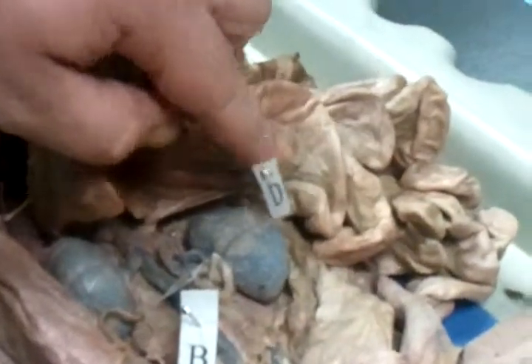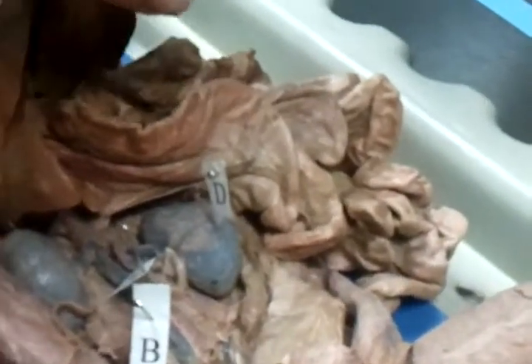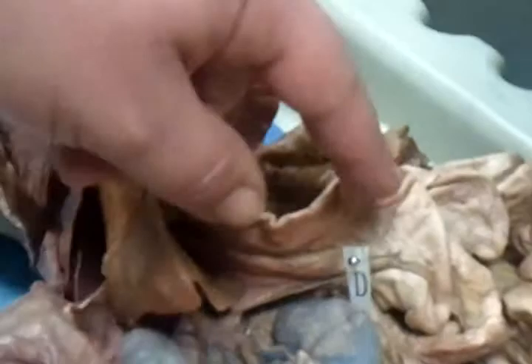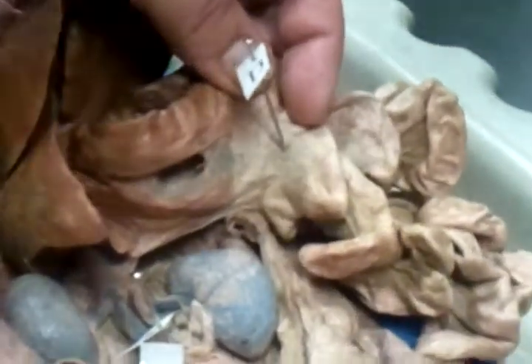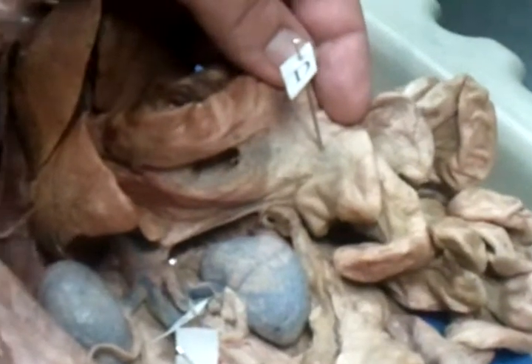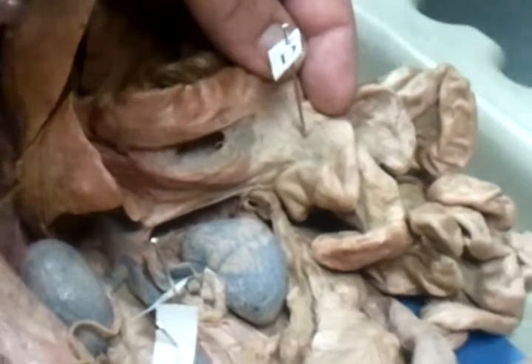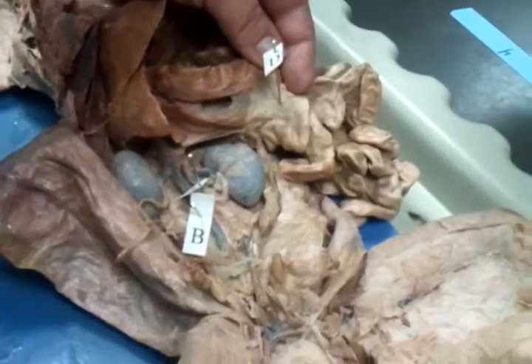Yeah, this is the pancreas. See? It's more of the mesenteric part. So actually, that would have been stupid for me to ask for the pancreas right there. Okay, so how can we tell that that's the pancreas? Where is it in relation to the stomach? It's right as they're coming off the stomach, associated with a certain part of the small intestine. And remember what that looks like? It kind of looks like a glandular type material because it kind of is.